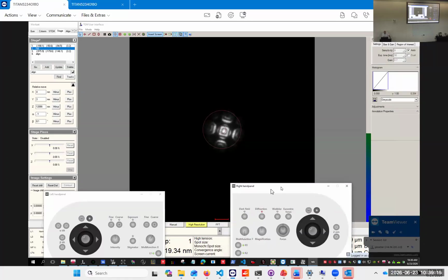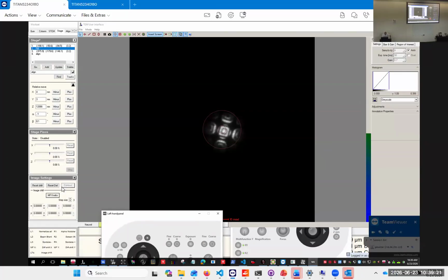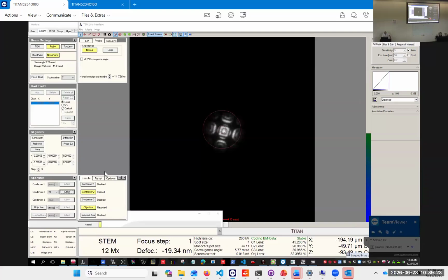So, close enough for the moment. And to see what we would do with it, we can adjust that now.